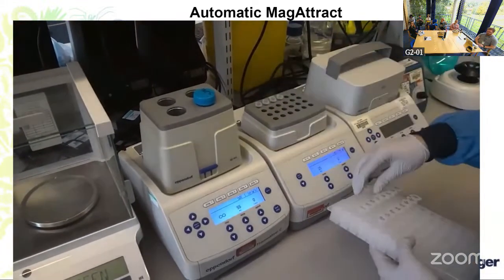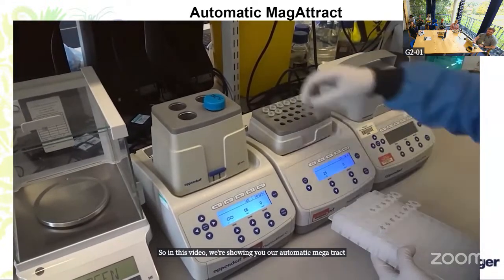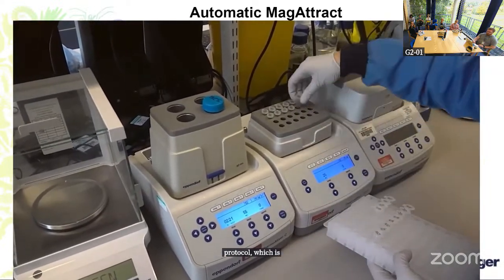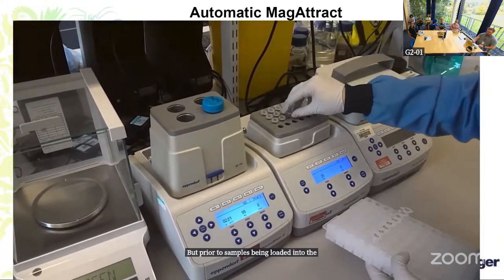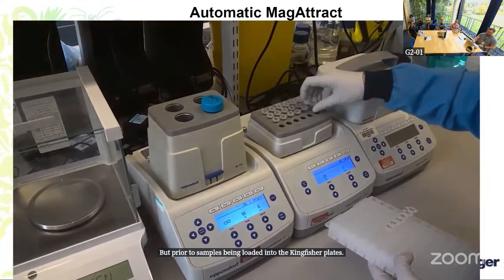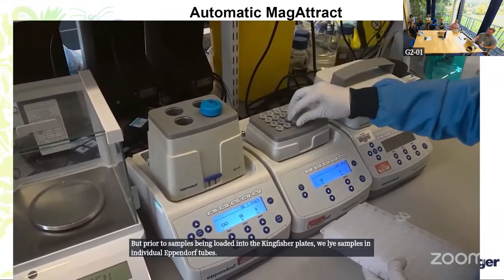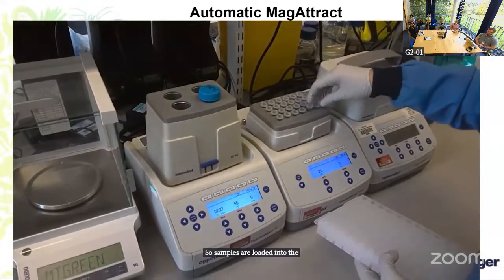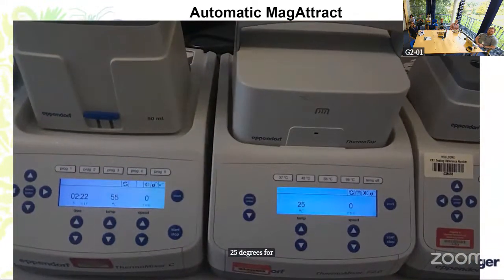In this video, we're showing you our automatic MagAttract protocol, which is done on the KingFisher. But prior to samples being loaded into the KingFisher plates, we lyse samples in individual Eppendorf tubes. So samples are loaded into the heat block at 25 degrees for 2 hours.